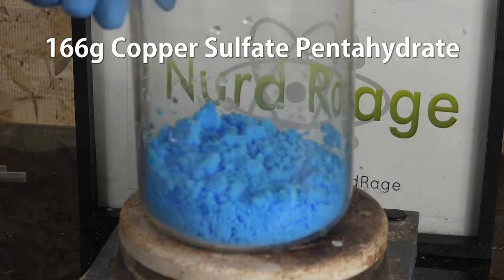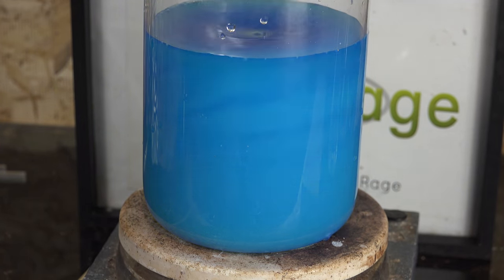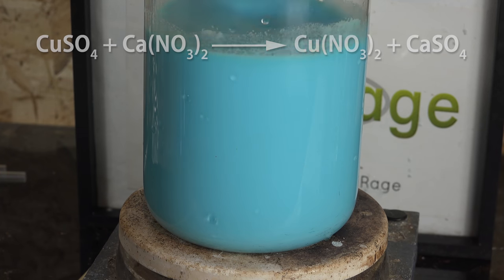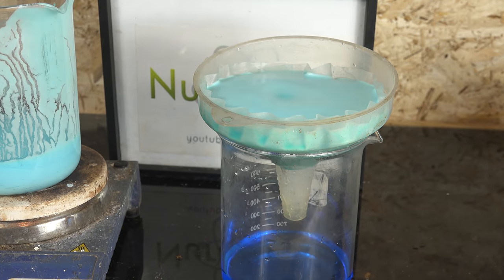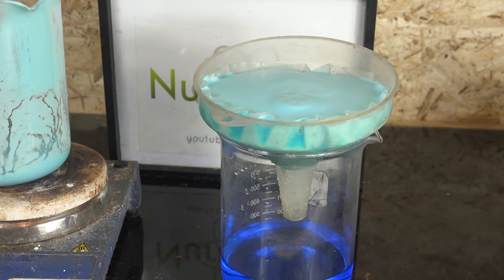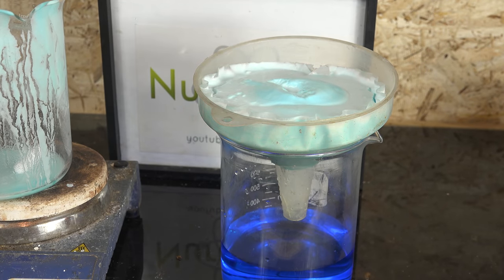In a separate container we get 166g of copper sulfate pentahydrate and dissolve it in 500mL of water. Copper sulfate pentahydrate is available as a root killer. After it's dissolved we add in the calcium nitrate solution from earlier. The copper reacts with the calcium nitrate to form copper nitrate and insoluble calcium sulfate. Stir the mixture to ensure the reaction proceeds. If it's too thick to stir you can add more water to thin the mixture out. I actually had to dilute the total volume to one liter before it could flow easily. After letting it react for 10 minutes we then filter the mixture. I strongly recommend using a disposable paper filter or coffee filter. The precipitate is calcium sulfate and difficult to remove from reusable filters like glass frits. I also recommend washing the precipitate with copious amounts of water to flush out any copper nitrate soaked inside. Anyway, we have a solution of copper nitrate.